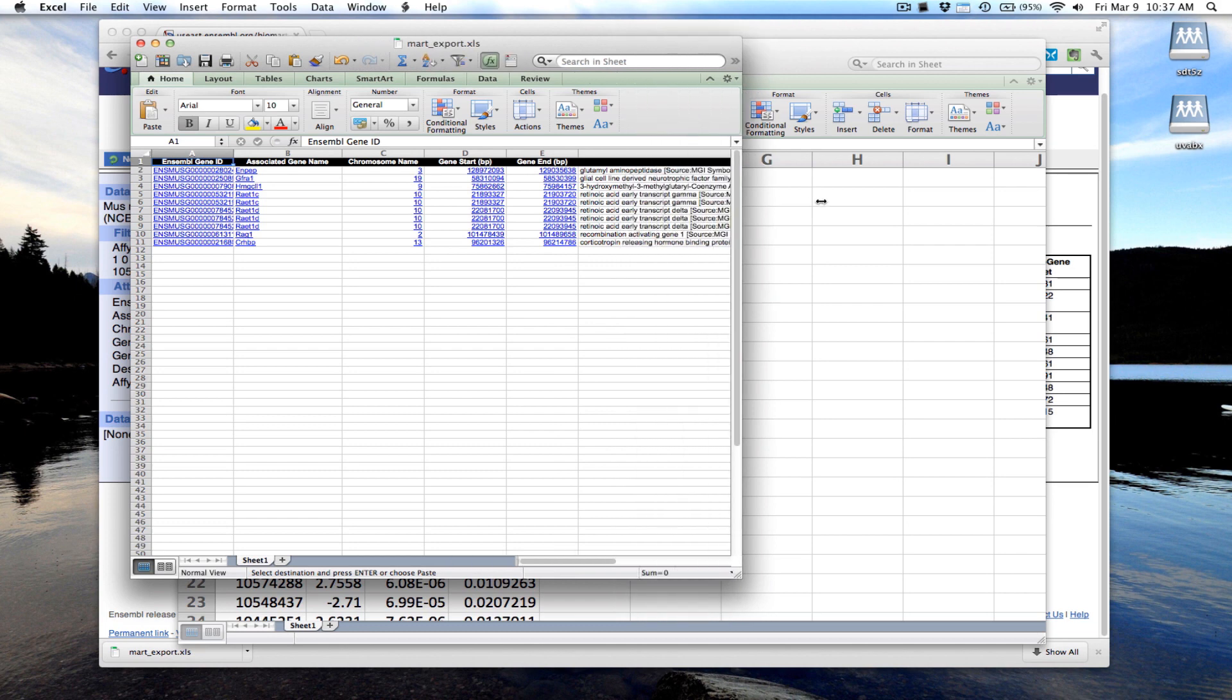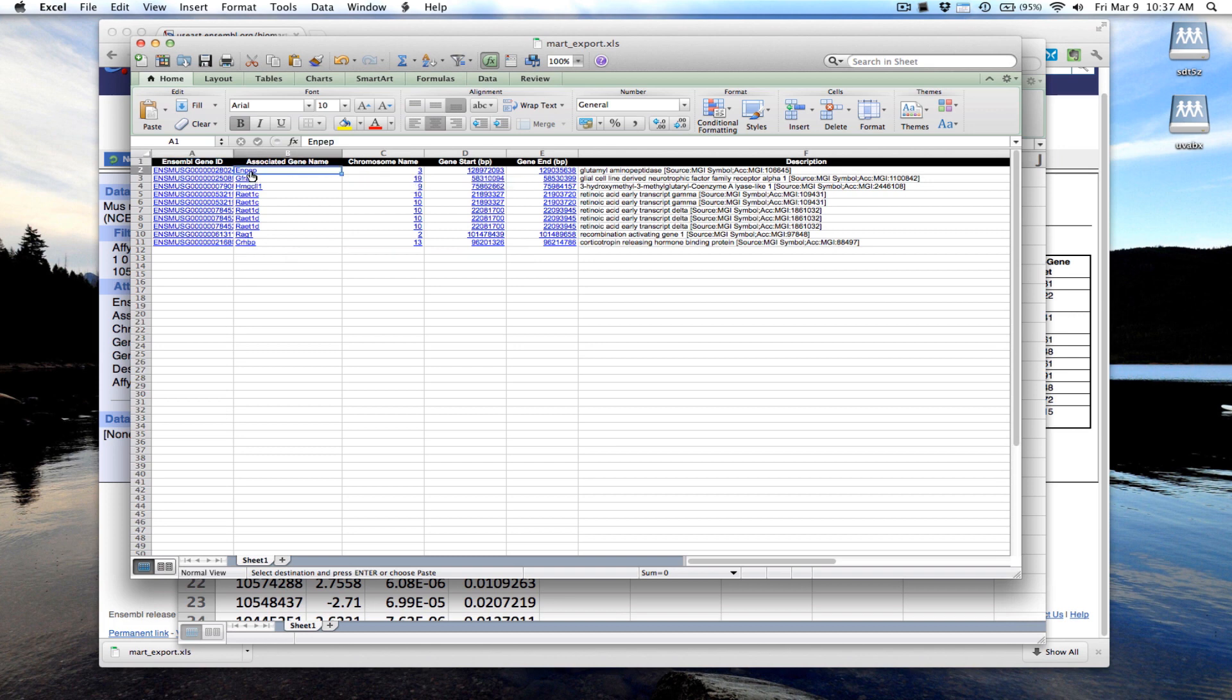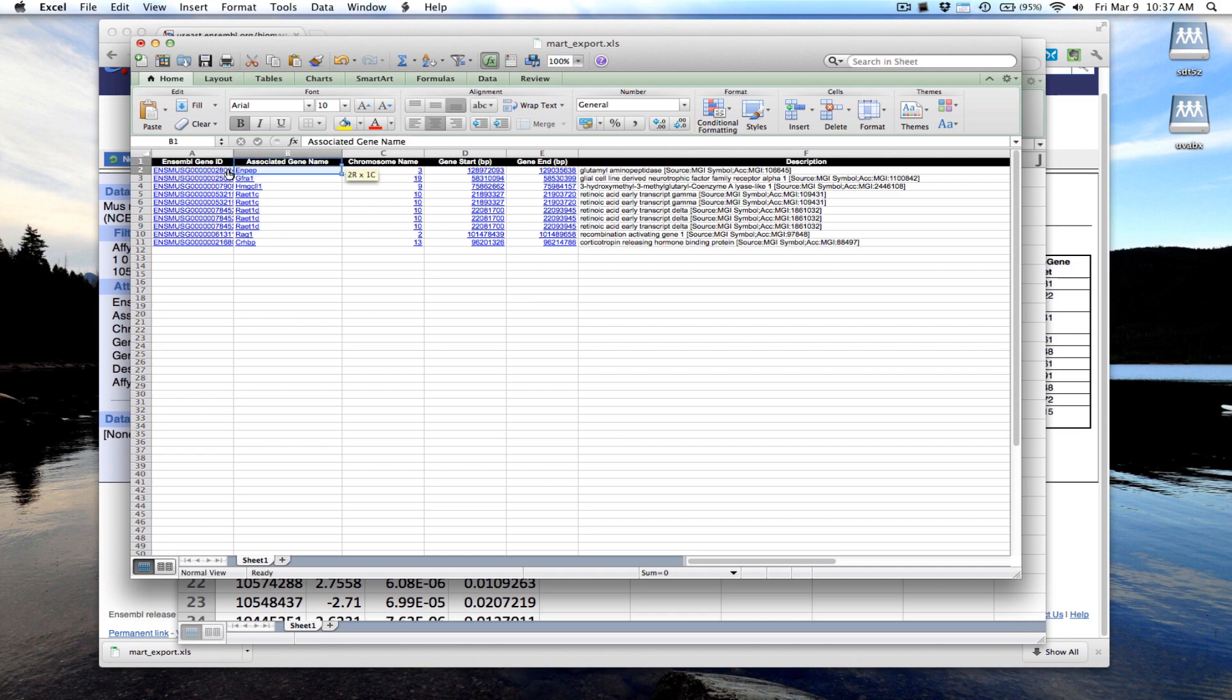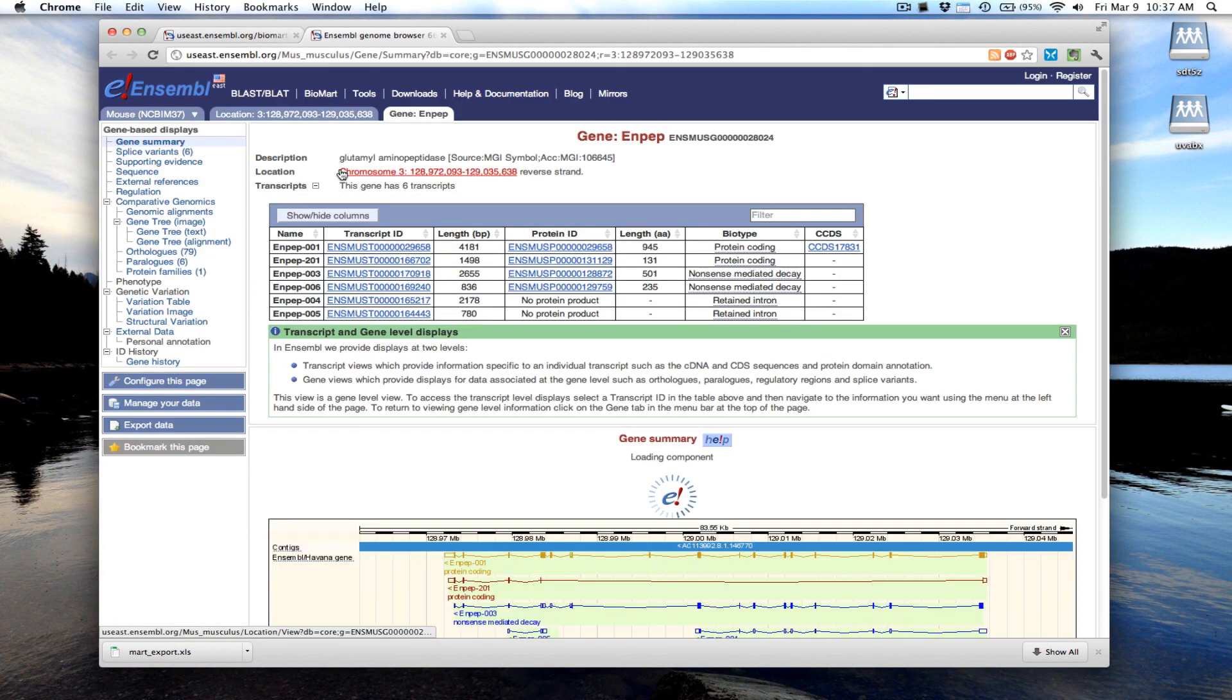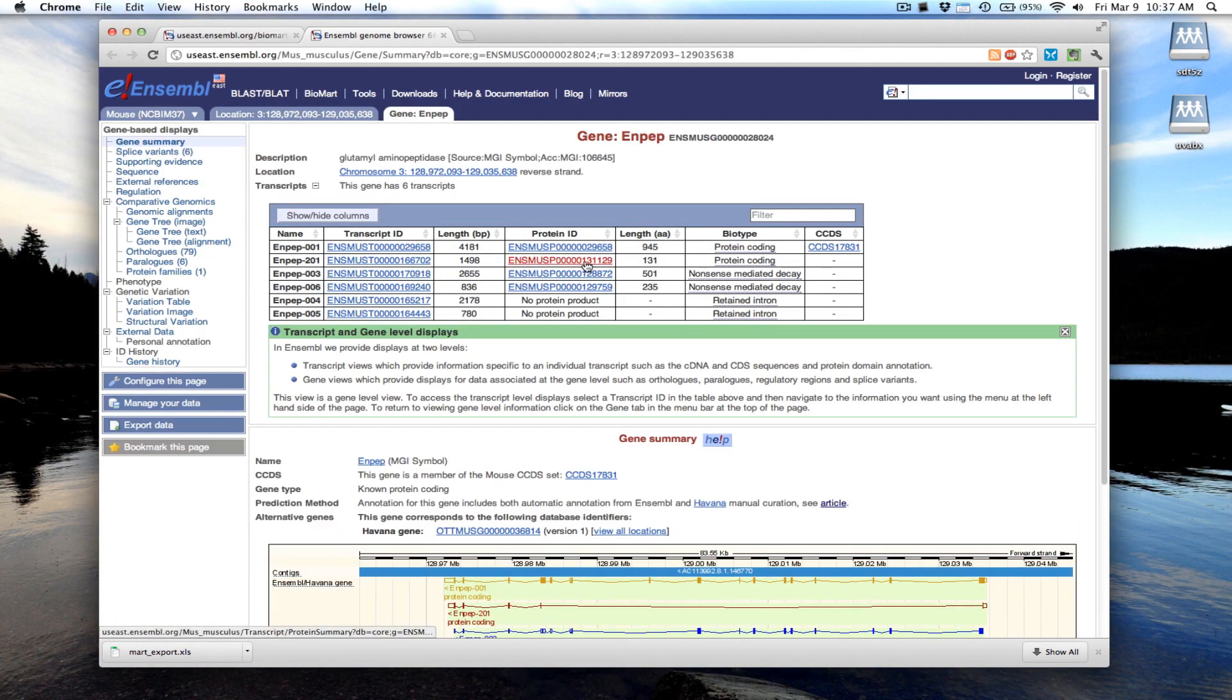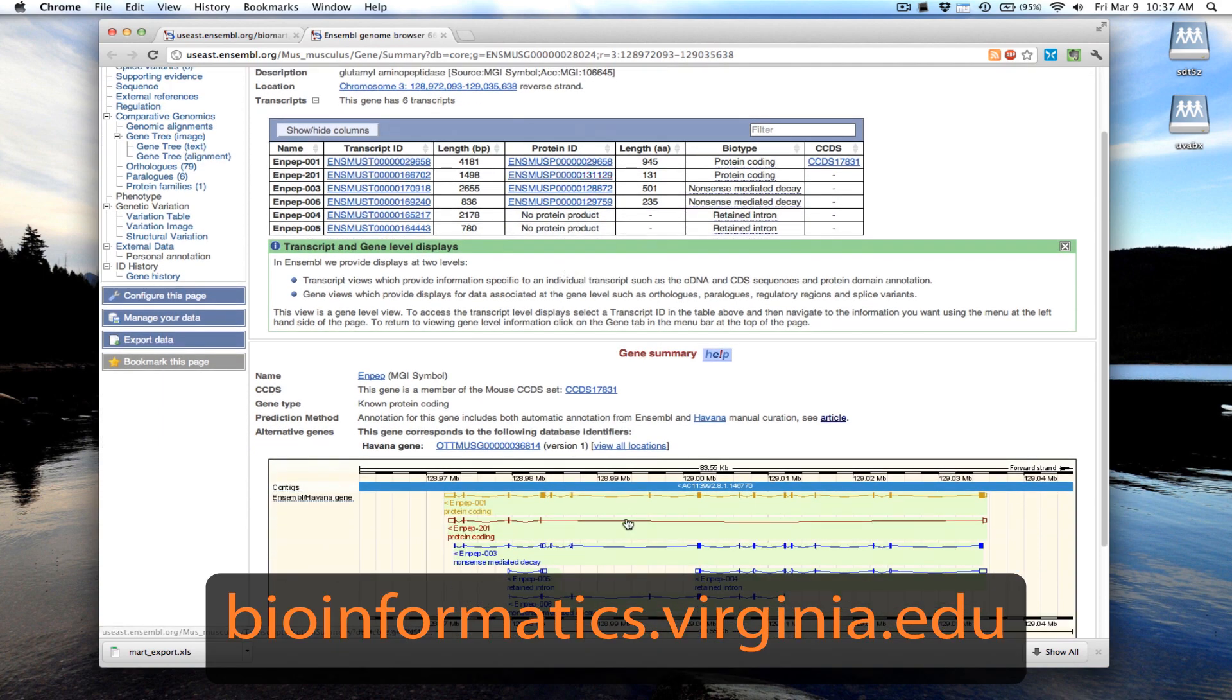These are links in here. For instance, if I want to look at this gene, I can double click here, and it'll take me to the Ensemble genome browser with this gene highlighted.